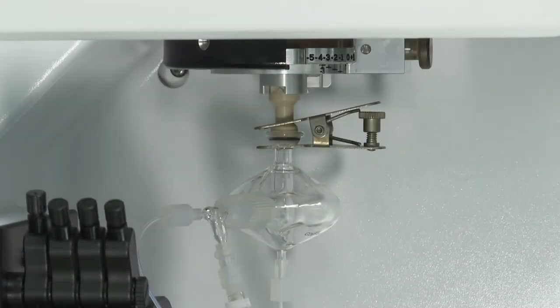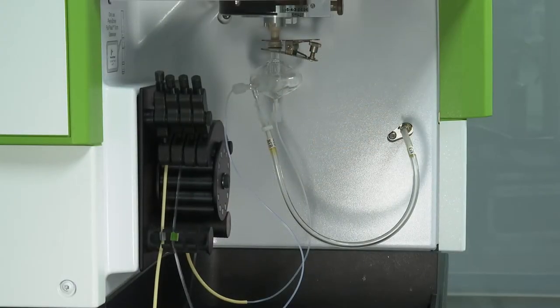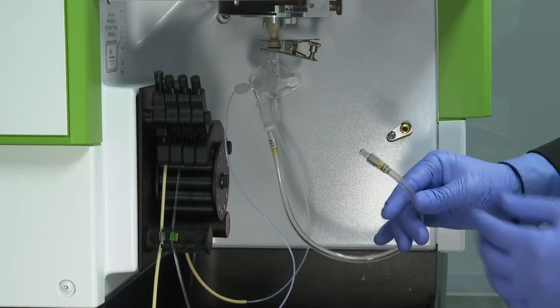To start, remove the current spray chamber and set safely aside. To do so, disconnect the argon nebulizer hose from the female quick connect fitting located on the sample introduction wall area.